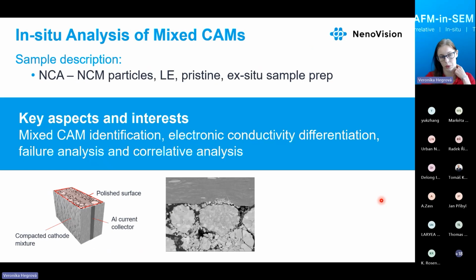And so what's the application? We were interested in in-situ analysis of mixed cathode active materials.